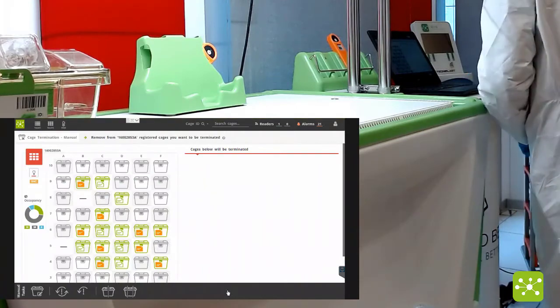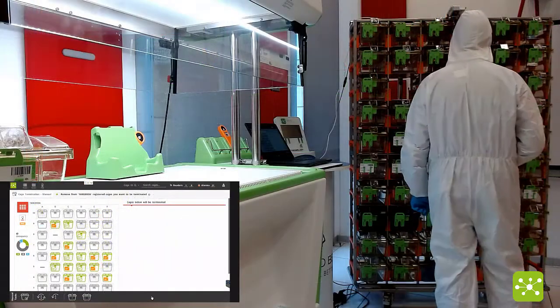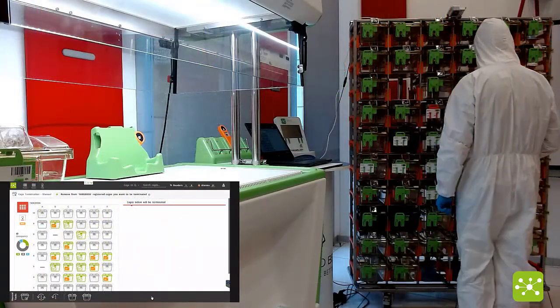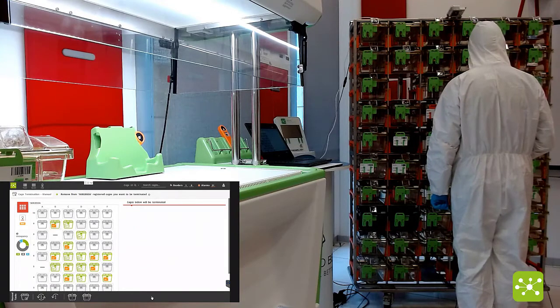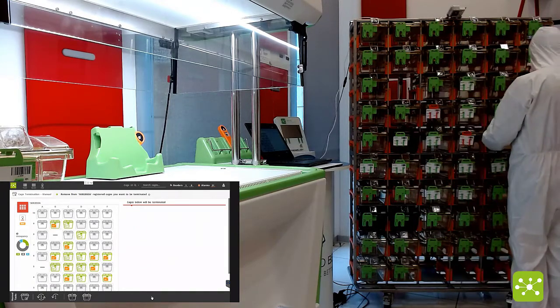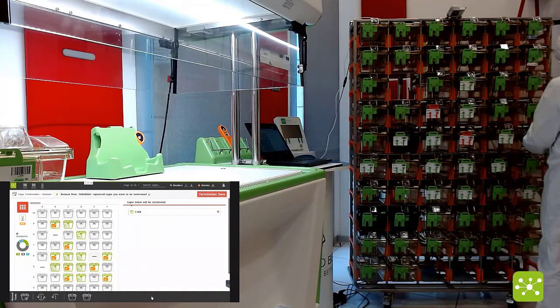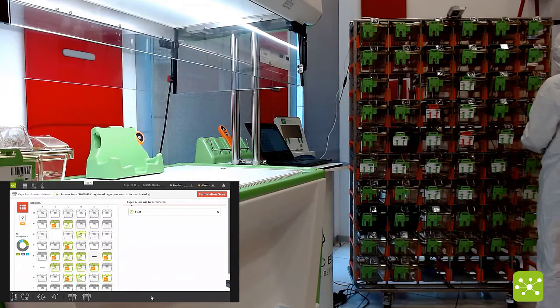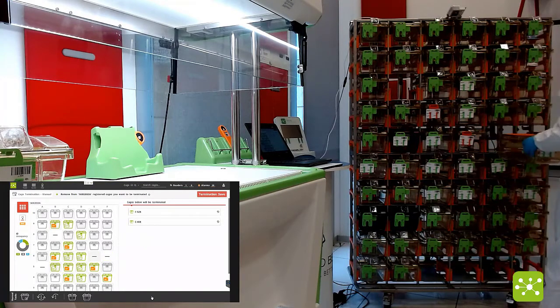You can click on this icon, you enter a different interface mode, where the system is asking you to physically extract only those cages that you want to eliminate.